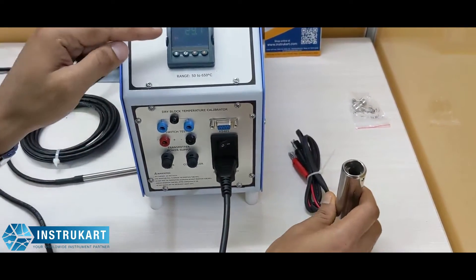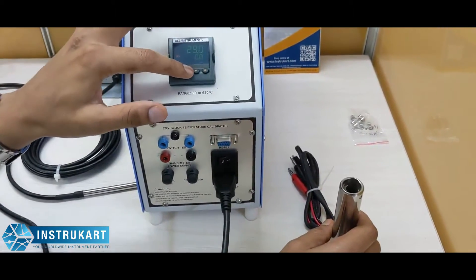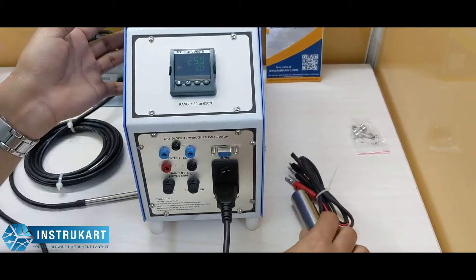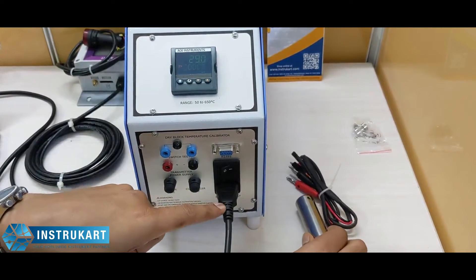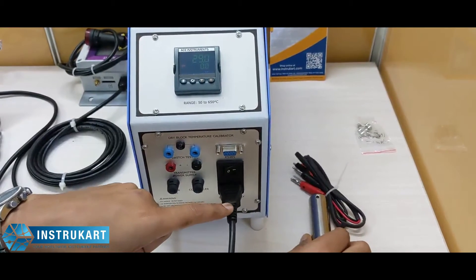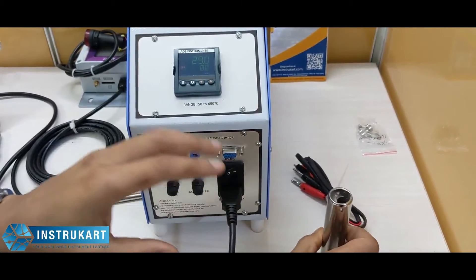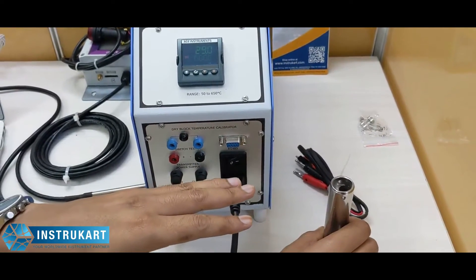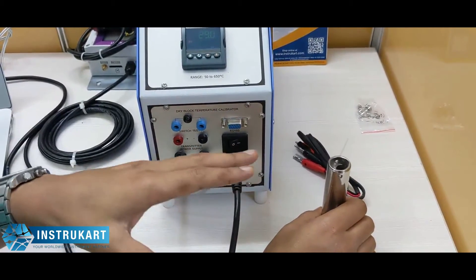You can switch the units between degree Celsius and Fahrenheit based on your need. It needs a power supply of 230 volts AC and can be configured for a frequency of 60 hertz, which is used in the US, UK and other countries.